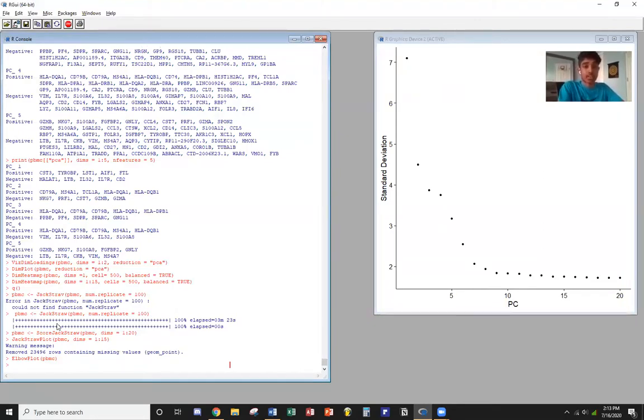Now we're going to cluster the various cells. We construct a KNN graph based on Euclidean distance. A Euclidean distance is the geometry of flat or two-dimensional spaces. This is done in PCA space using the FindNeighbors function. To cluster these cells, we use the FindClusters function.